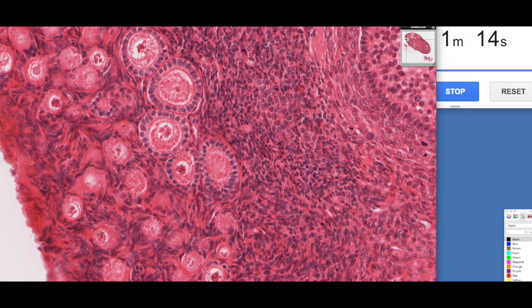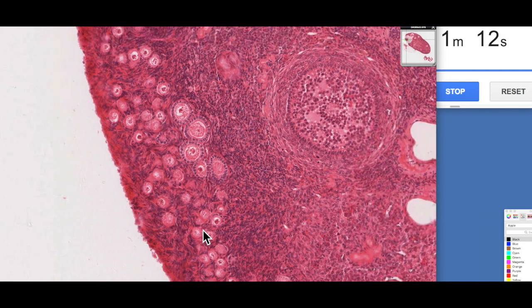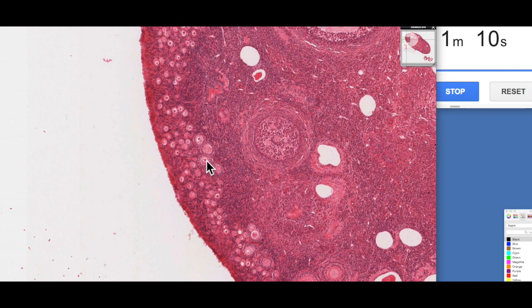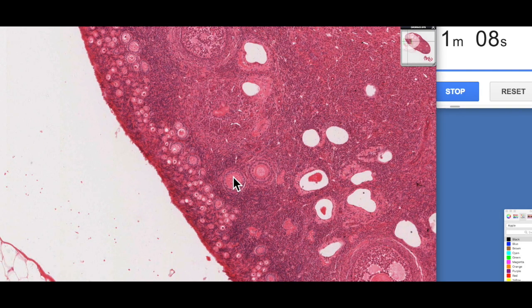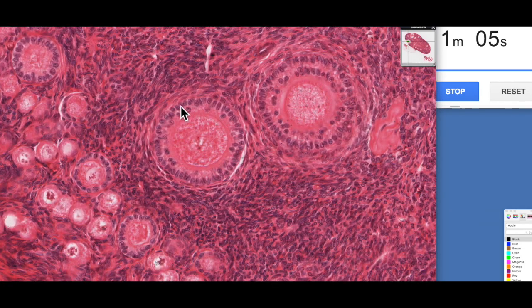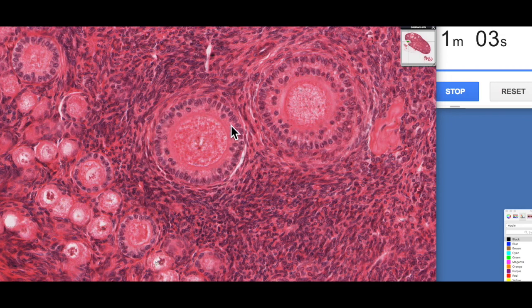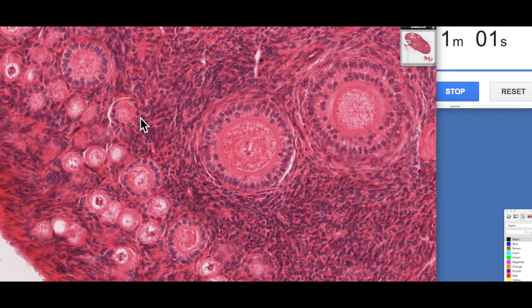And then those granulosa cells continue to divide. Eventually we'll move from this single layer of granulosa cells to one which has a double layer or more. So you can see an example of that here. This one here is known as a unilamina primary follicle. This one is known as a multilamina primary follicle. Unilamina means one layer of granulosa cells. Multilamina means multiple layers. You can see how big the oocyte's gotten here.